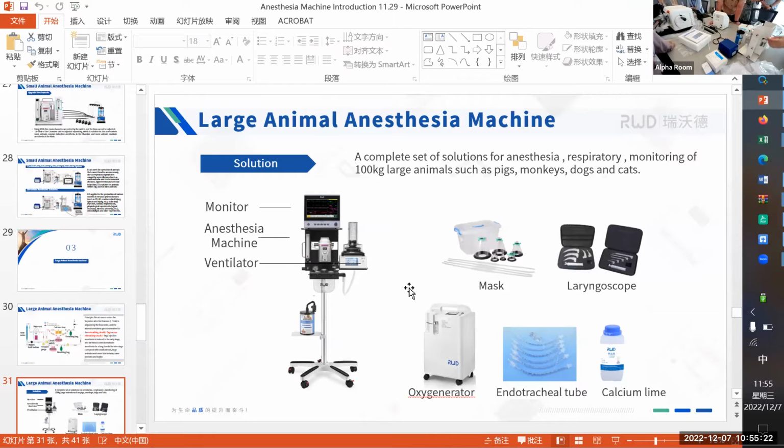Actually, there's no filter in the air pump. So you maybe need the filter. Yeah, you need the filter to connect the chamber, because this one is just to provide the gas. Oxygen and air. Carbon monoxide, we cannot use it. Carbon dioxide. Monoxide, I mean CO.